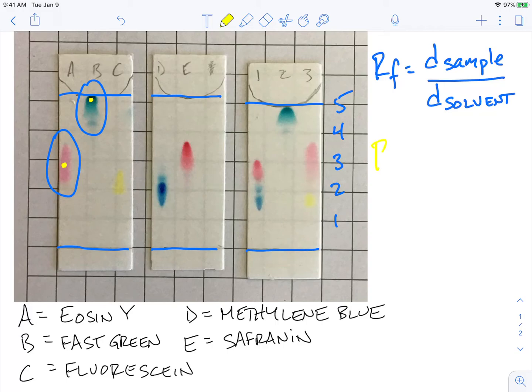So if I was going to do my RF value for sample A, the Eosin Y, I would—so again, our solvent front, if we count up. Let's see. Whoops, I did that wrong. Let me undo that. So we would have one, two, three, four, and five.